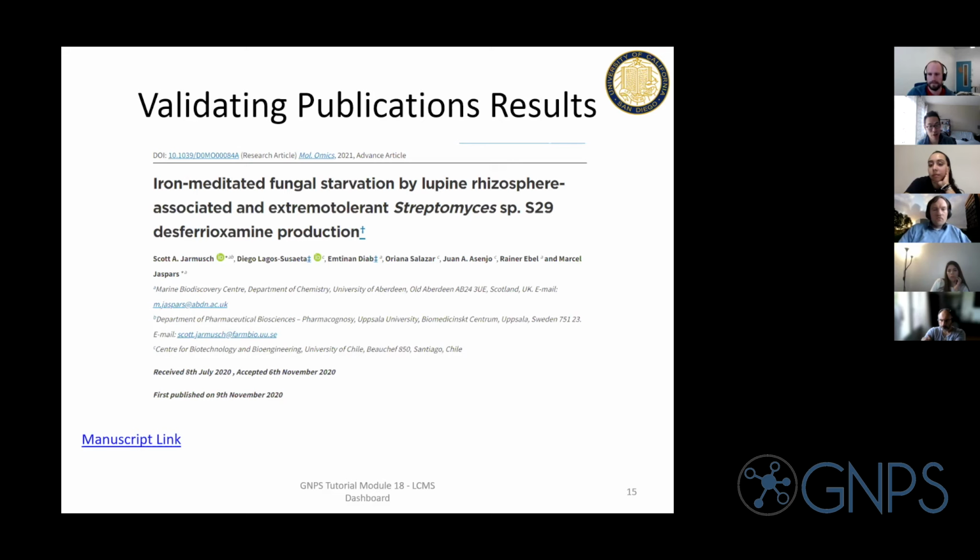That's kind of our scale right now. One thing, just giving you an idea of a little bit of the infrastructure. We can source data from many different locations. So we're talking about public sources like Metabolomics Workbench and MetaboLights. And actually, Ewan, one of the developers for Metabolomics Workbench, is in the audience, and he was awesome and helped us get the support in there. And then we also have support with MetaboLights.